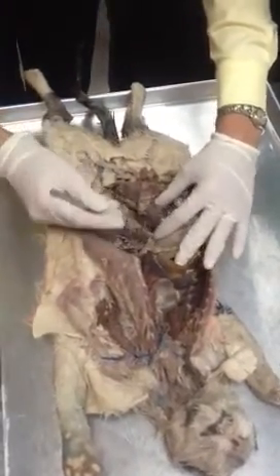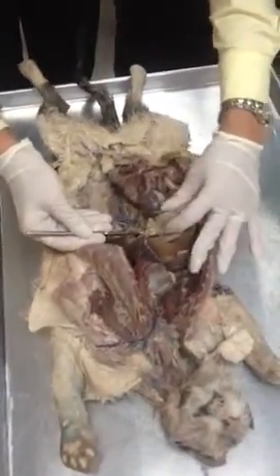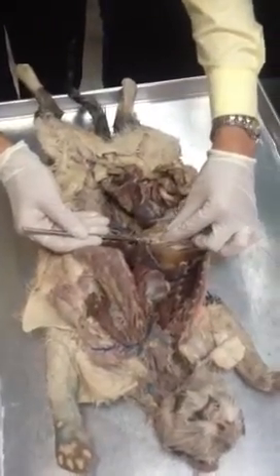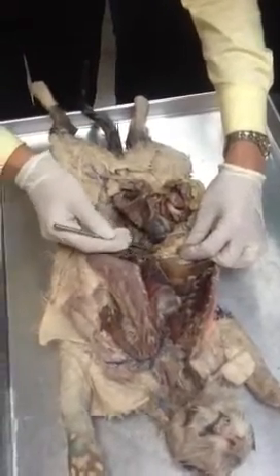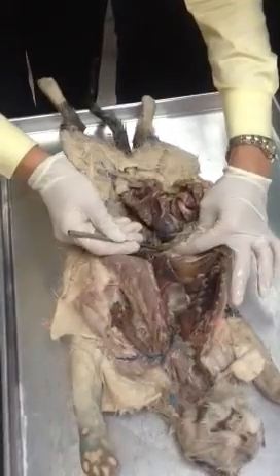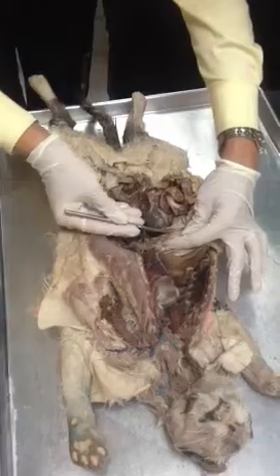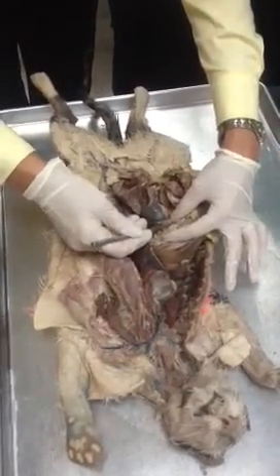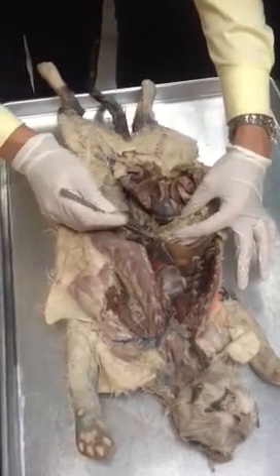Now, celiac artery will branch into 3 arteries, and that is this over here will be hepatic, right? Hepatic artery, then gastric, gastric artery, and here this continues into the spleen, that way it is a splenic, this big one, right? The splenic artery, that's what we need to know. Splenic, gastric, and hepatic artery.